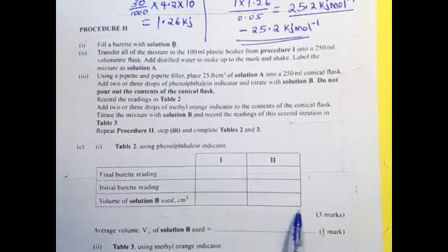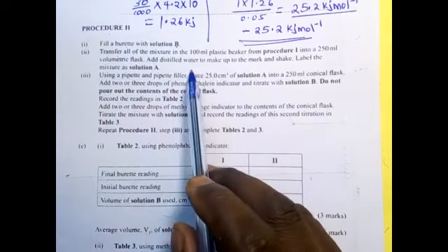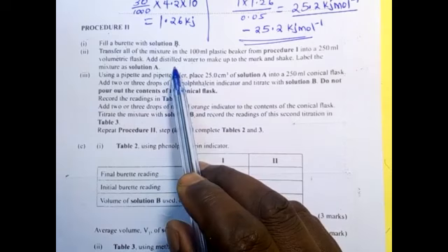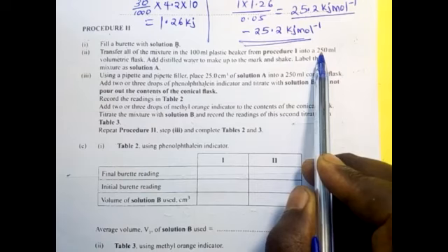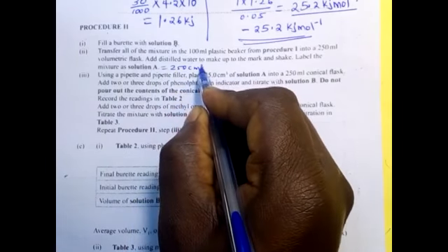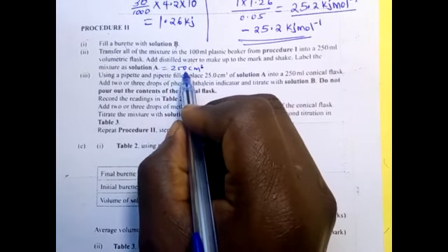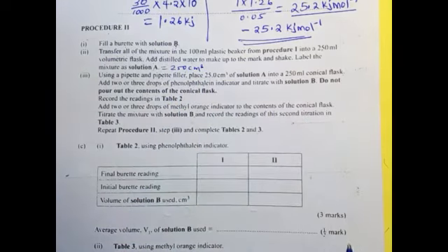Yeah, that is it. So the information I want you to understand is that we have 30 cm³ of sodium carbonate solution from procedure 1. We have put the solution into a 250 volumetric flask. We are adding water up to 250 cm³. So we are going to prepare solution A, which is 250 cm³. Right? This is the information you need to understand. So HCl is going to react with the carbonate solution. So that is correct.